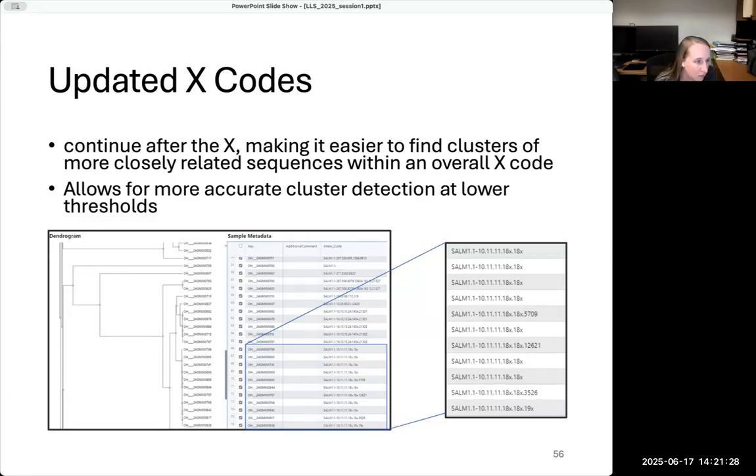Someone says you can display allele differences in PulseNet 2.0, but when isolates are super close together in the tree, it can be glitchy and not show up. But there's also an allele matrix option. Okay, perfect. So if there are some isolates you need to look into more, you should be able to pull up the actual distances so you can compare them.